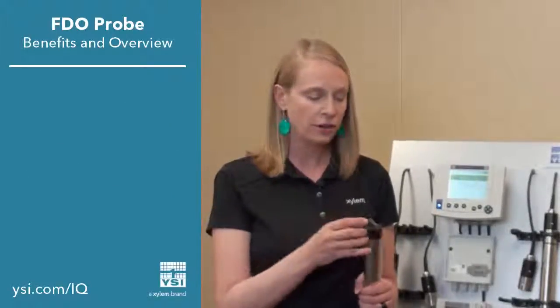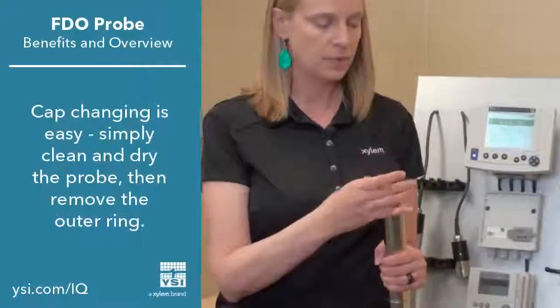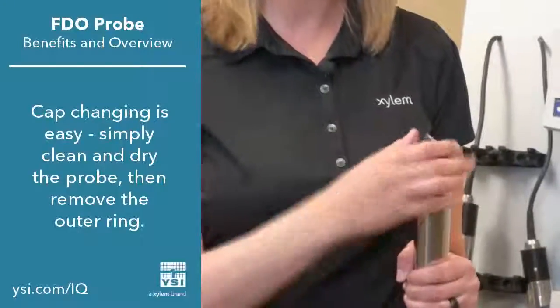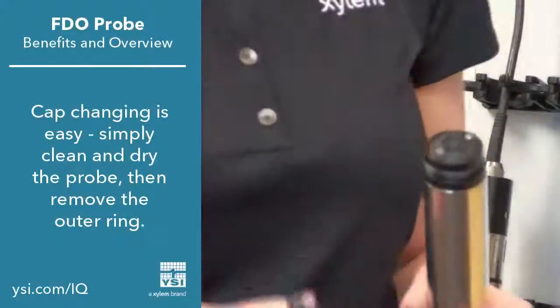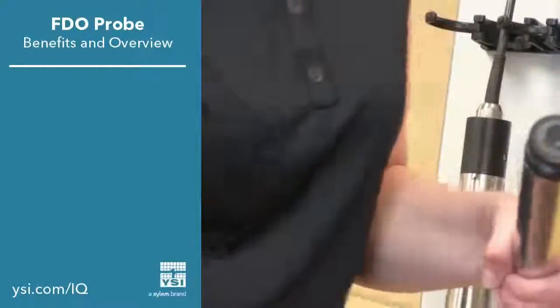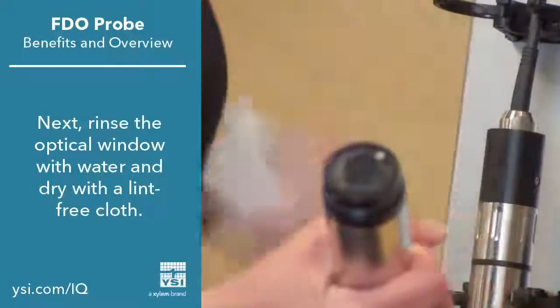I'd like to go ahead and show you how to change the cap. First, make sure it's clean and dry and remove the outer ring that holds the sensing cap in place. Next, make sure the optical window is clean. You can rinse it with water and clean it with a lint-free cloth as necessary.